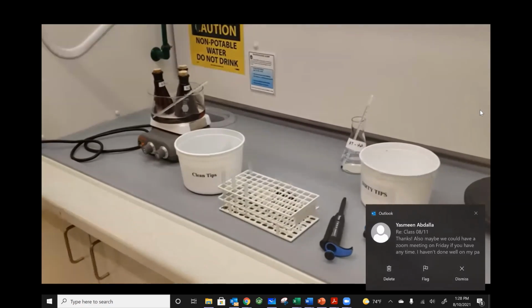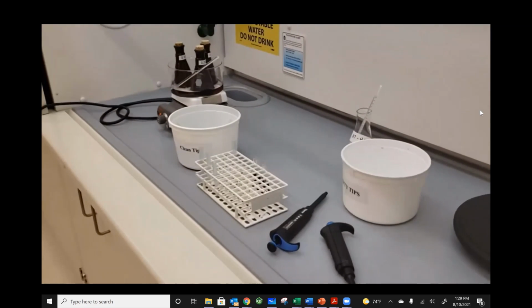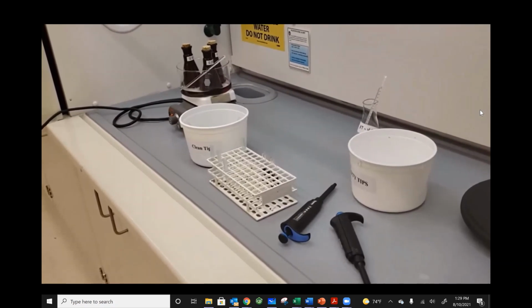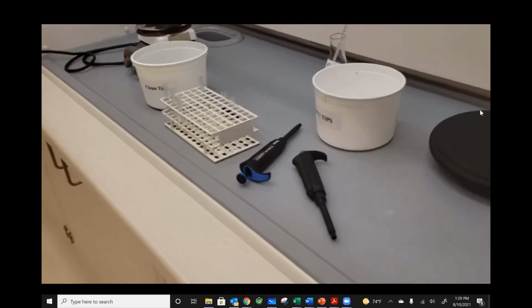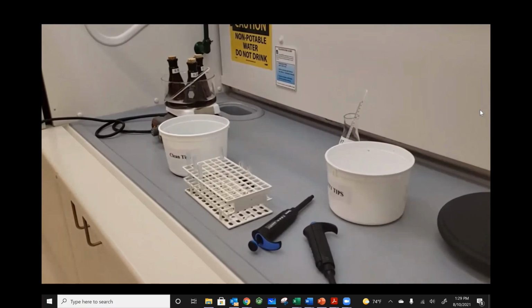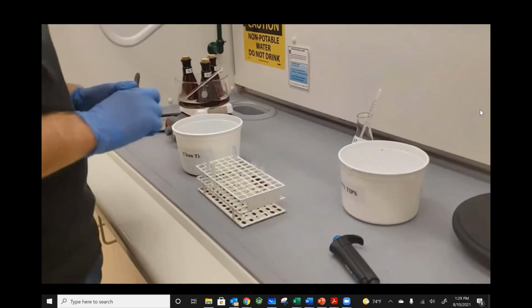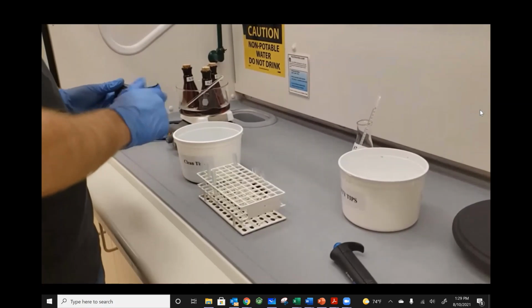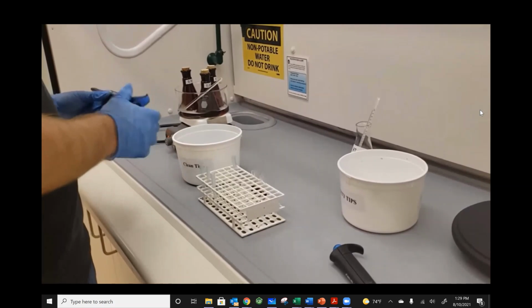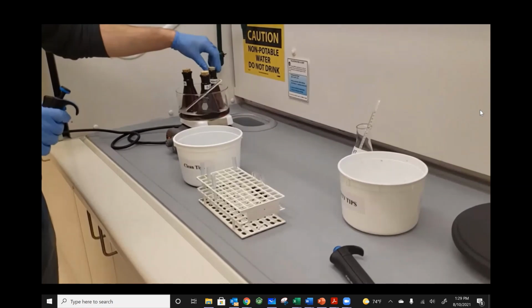All right, so I will consult my table. I need for 1-4, 800 microliters of hydrogen peroxide, 1,000 microliters of hydroiodic acid, and 200 microliters of thiosulfate. So we'll start with the 800 microliters of hydrogen peroxide, which is this guy, right?